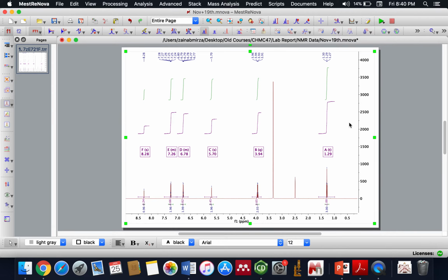Okay, so we finished our multiplet analysis. Right now, it's not giving you any information other than the fact that the T here is telling you this is a triplet coming out at 1.29 ppm. It's reading off the x-axis basically. Again, these are multiplets, they're singlets, and so on, right? But we want this information more concise in a table, in a text box.